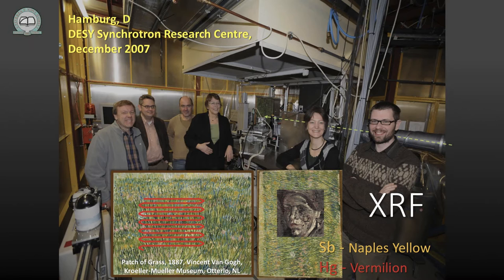Okay, so then this is where our involvement, let's say, with X-rays and painting started. So not far from here, a little bit to the north, in Trieste, there is an institute called Sincrotrone Trieste. It's a very big machine that produces very intense X-rays. So there are more of these institutes throughout Europe. And one of them is in Hamburg. It's in the north of Germany.